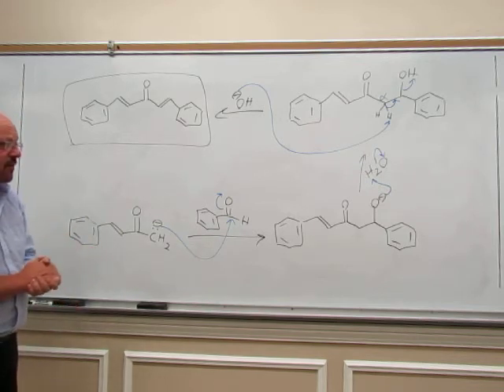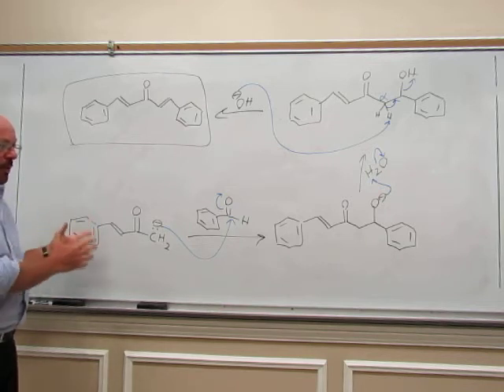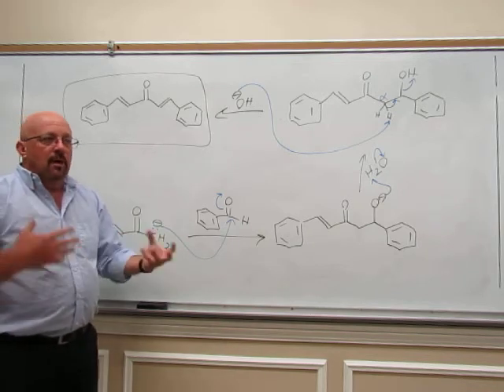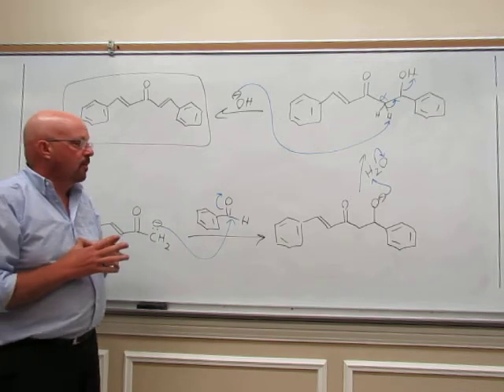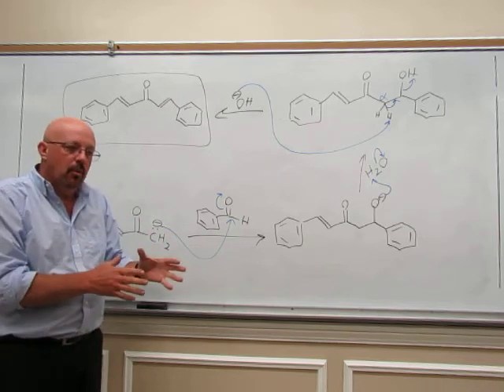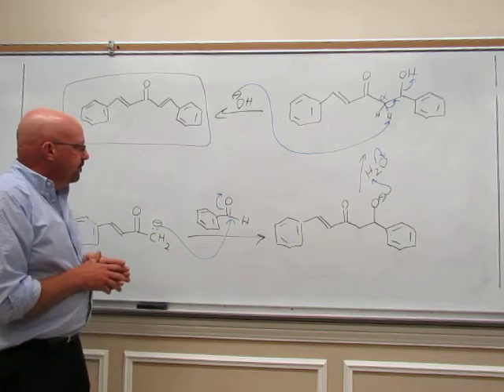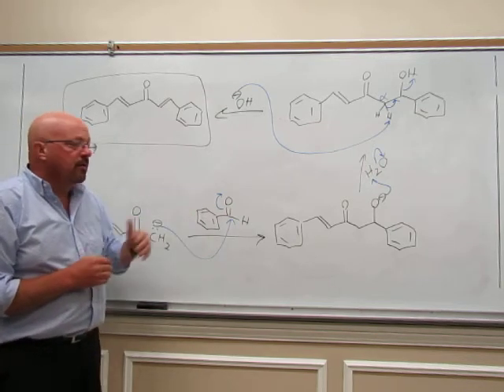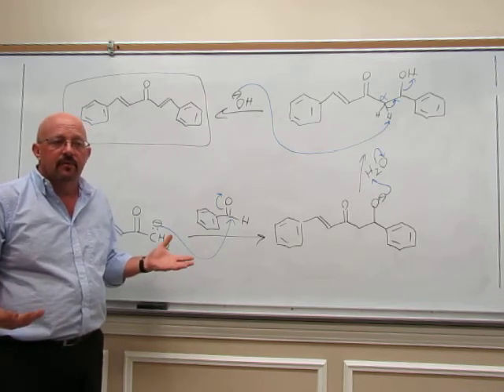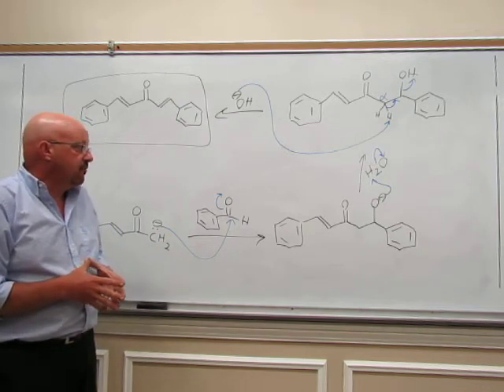The number of equivalents for this reaction is very, very important. As I mentioned, we're doing 2 equivalents of benzaldehyde and 1 equivalent of acetone. If you do one equivalent, I had the product there shown what we get. And so any slight change from 2 equivalents to 1 equivalent, you're going to get possible side products. If you've got more than 2 equivalents of benzaldehyde, then you just have extra benzaldehyde left in the reaction. So that's a possible contaminant. We just have extra that doesn't react.